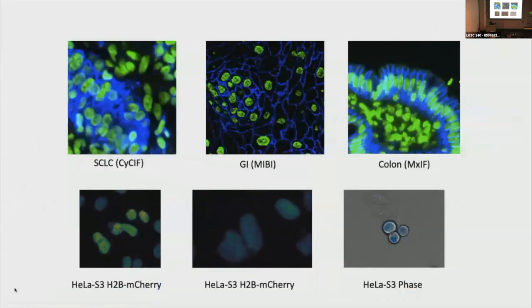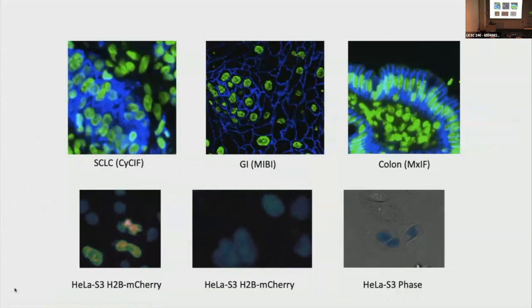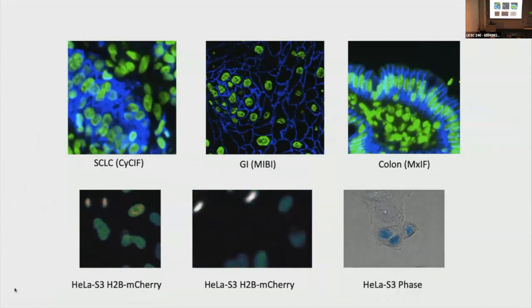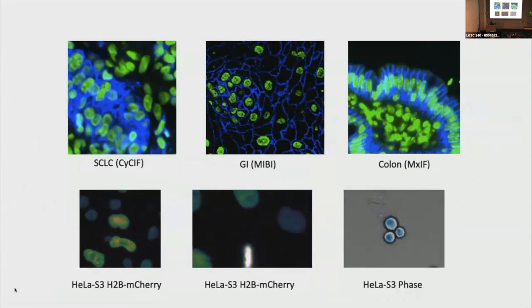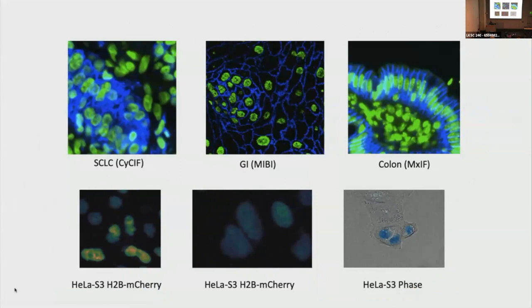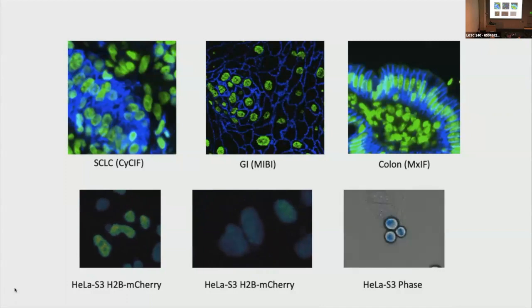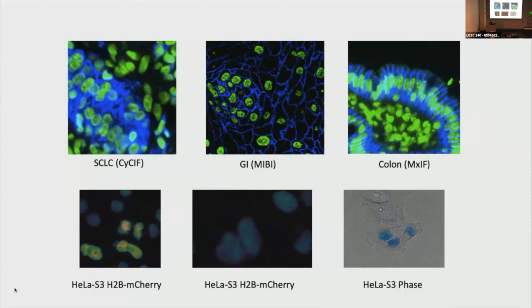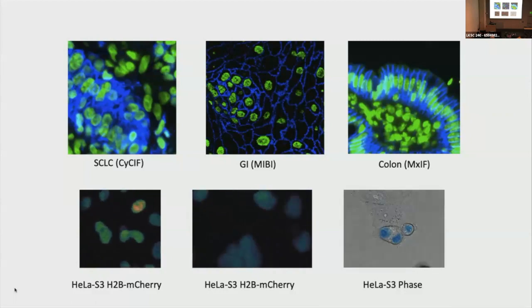The path goes through just generating data. I'm not going to belabor this point. It's complicated for the tissue imaging data, just because there's a large variation in cell morphology and signal to noise across the different platforms. For the live cell imaging data, it's just really hard because here you have this problem of time. Everything needs to be temporally consistent, both the labels and also the labeling of dynamic events. And what you also have to do is label the full distribution of events, right? Cell divisions, while our textbooks tell us, one cell turns into 2. When you're looking at a lot of transformed cell lines, this isn't what happens many times. And you need your labeling framework to be able to capture these sorts of events so that you can actually have the AIs pull them out for you.